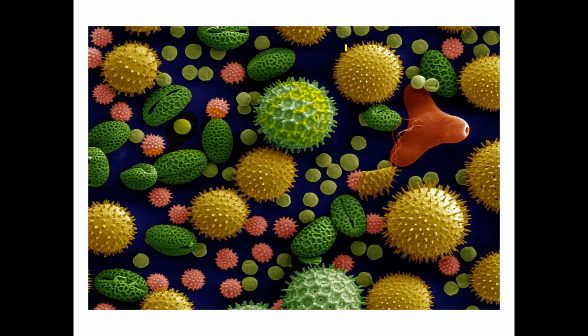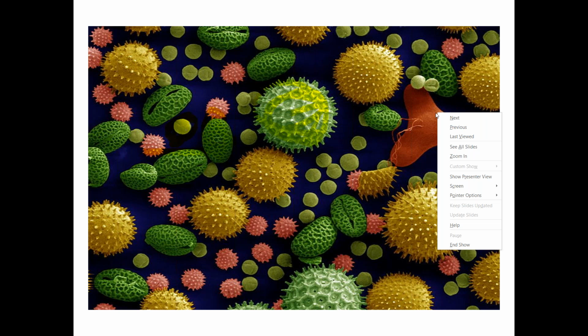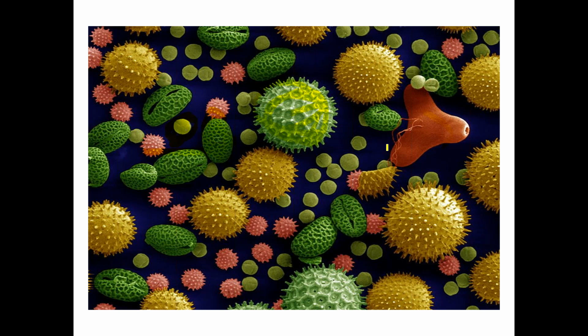You have some round bold specimens with spikes. You have got some triangle-like structures here, and you can see some triangle-like structures here as well. You can see some oval structures here, a group of oval structures, and even various colors you can visualize. It all depends upon the topography.